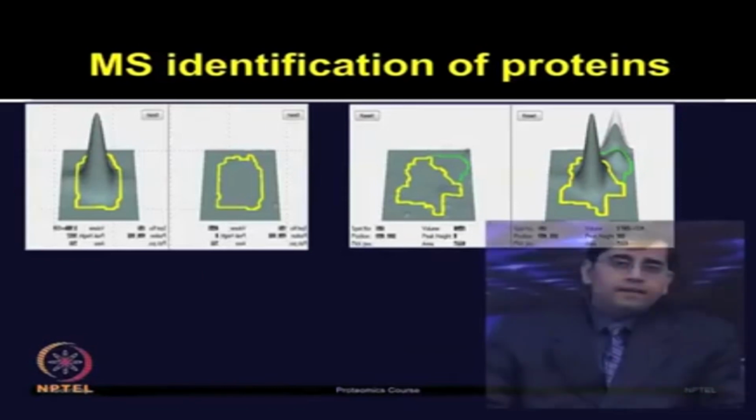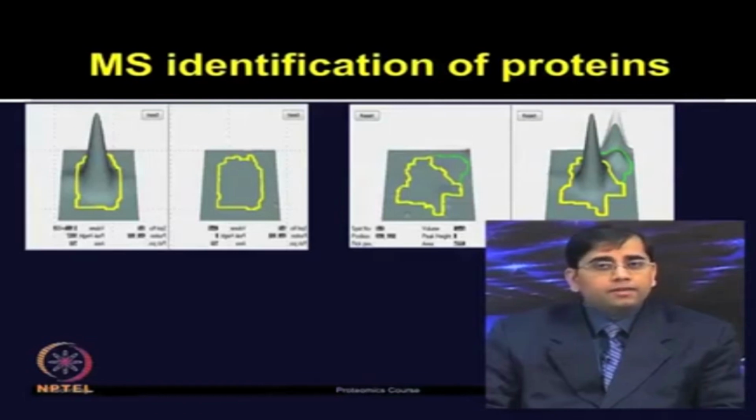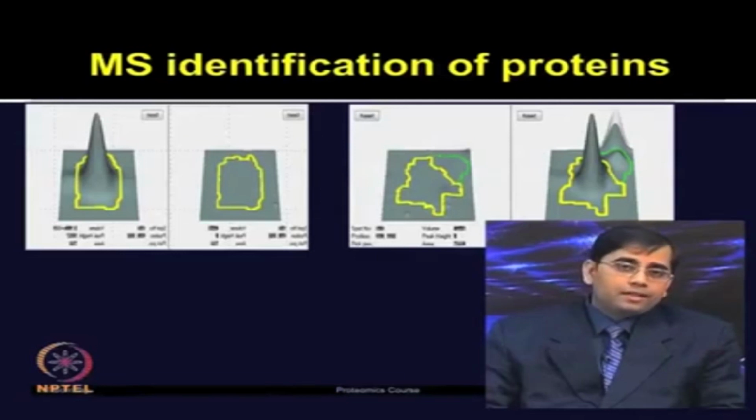After the identity of these proteins was established, 7 proteins were not detectable in the healthy controls and only observed in the SARS patients. The identities of those included glutathione peroxidase, PRX2, retinol binding protein, vitamin D binding protein and serum amyloid A proteins.